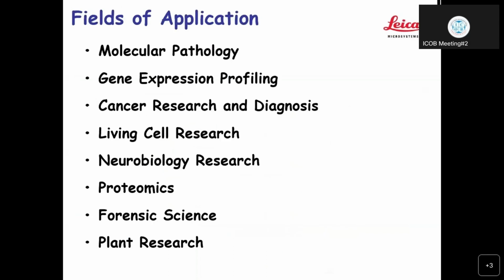Laser microdissection can be used for many applications, mainly in molecular biology, particularly nucleic acid research, neuroscience, cancer research, forensics, proteomics, plant research, for cutting cell cultures, and for single-cell isolation. Laser microdissection is even used in climate research, especially for examining the annual rings of trees.